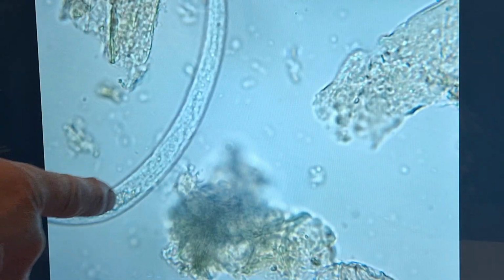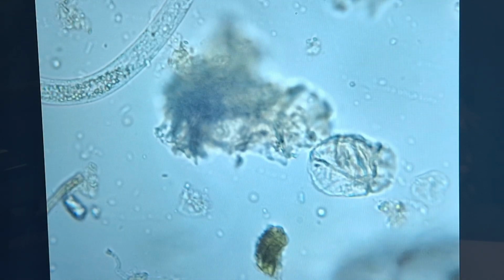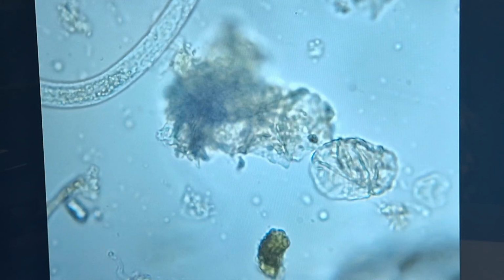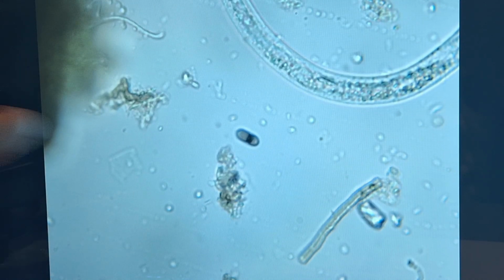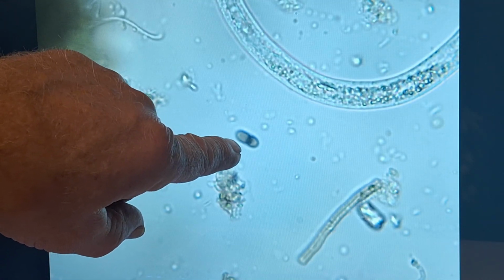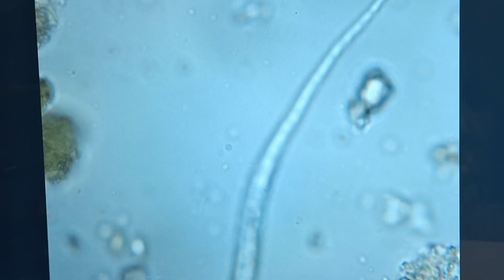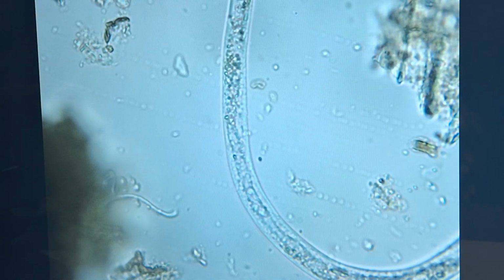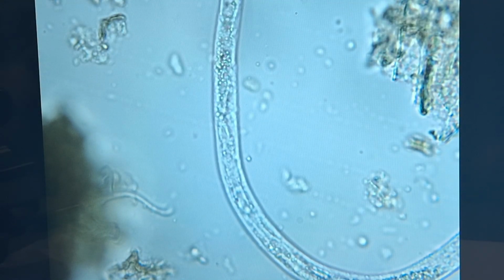That's a good look at that one right there. We'll move through the body. We can see actually the bacteria inside of it that it's consumed already. Those little dots, different colored dots inside of it. There's fungal spore. I believe it's dividing. You see this fungal. That might be a yeast, actually. I could be wrong. It's either a fungal spore dividing or a yeast. There's a good shot of the bacteria inside. Let's go see what else we can see.